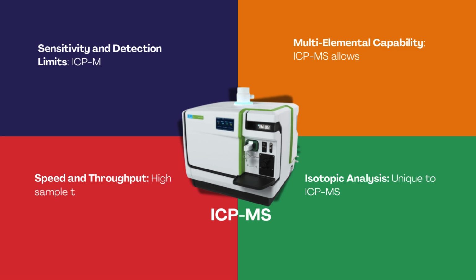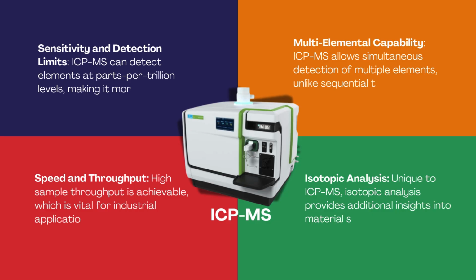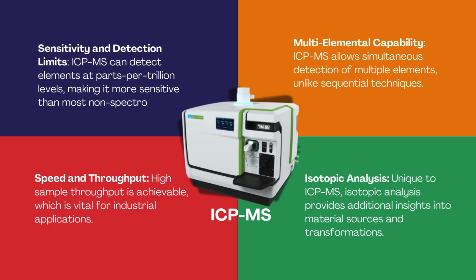Let's explore the key advantages of ICP-MS in more detail. First, multi-element detection. Unlike other methods, ICP-MS can identify several elements at once, saving both time and resources. Secondly, sensitivity. Its ability to detect elements at parts per trillion levels ensures even smaller traces are identified. The third one, isotopic analysis.